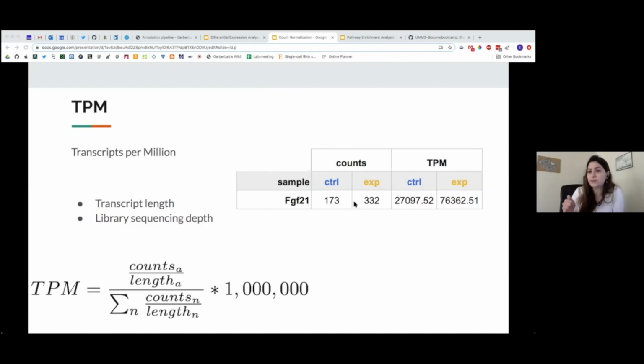And it even makes the plot that Alper showed you guys of how many genes are not expressed mixed with how many genes are expressed, the histogram, easier to see the separation of non-expressed to expressed genes. Okay, thank you. No problem.